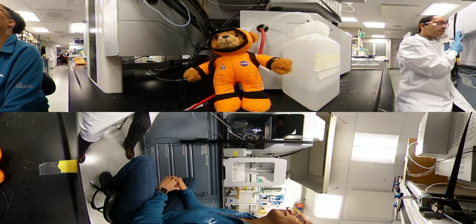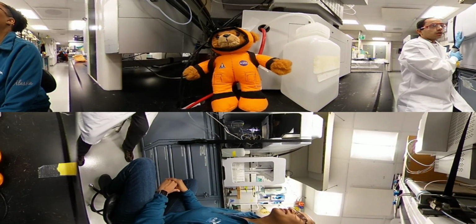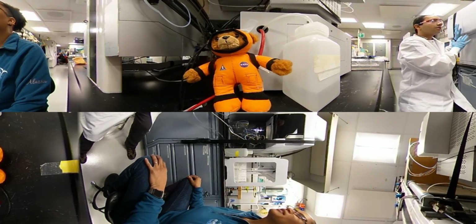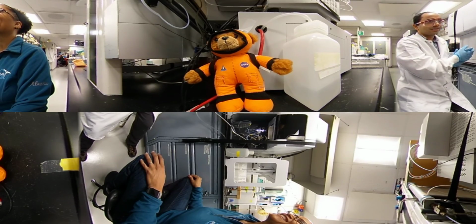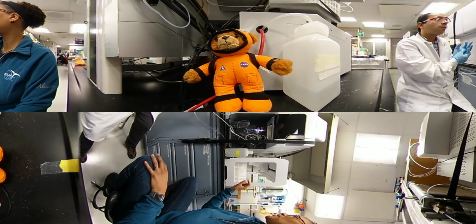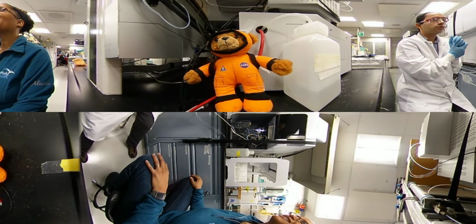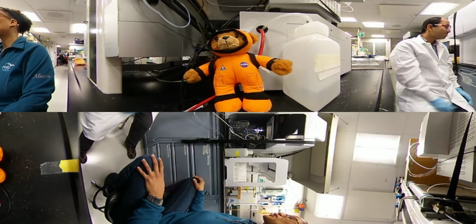And so we measure that and can quantify or tell how much of each of these elements there are, or the concentration of these elements. So that's a very, very brief description of what it does. Excellent. So in the end, you'll know the different elements that are there, and how much of the different elements are in that individual sample. Thank you for sharing that with me.